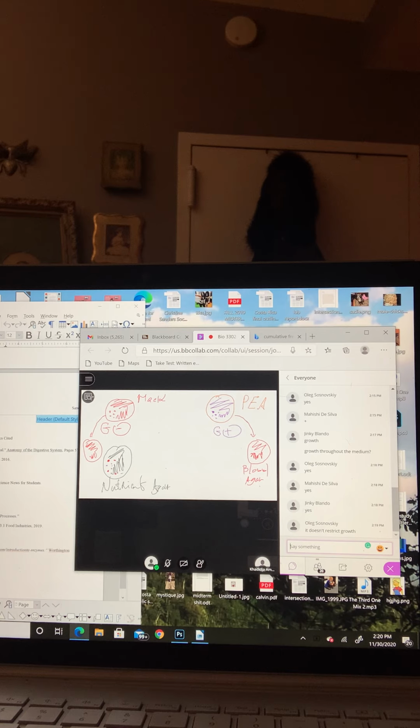If you didn't get a good stain for the gram staining, so if your slide is not clear and you can't differentiate between the two bacteria, the gram positive and gram negative, I'm talking about the gram staining, you can do your gram staining again, by taking a colony and doing the gram staining, so isolated.